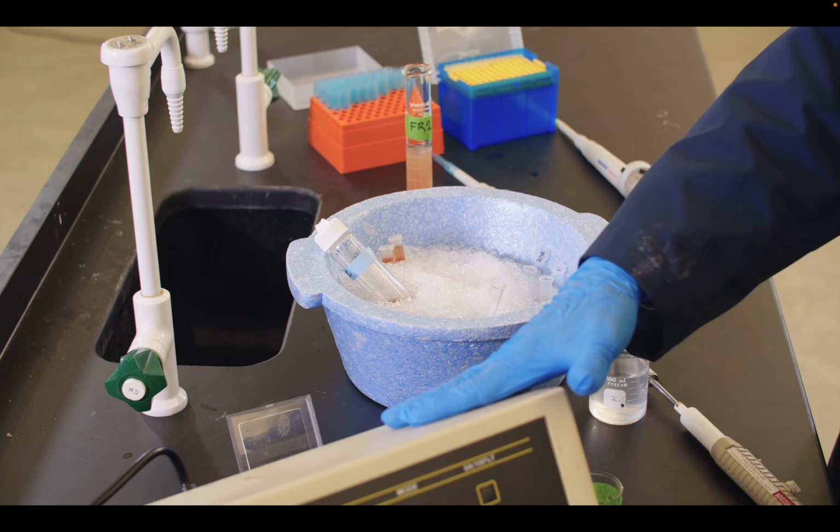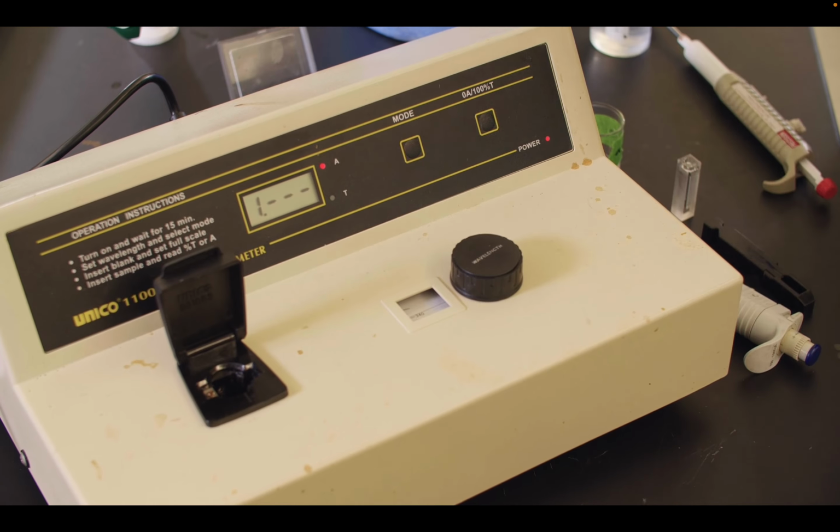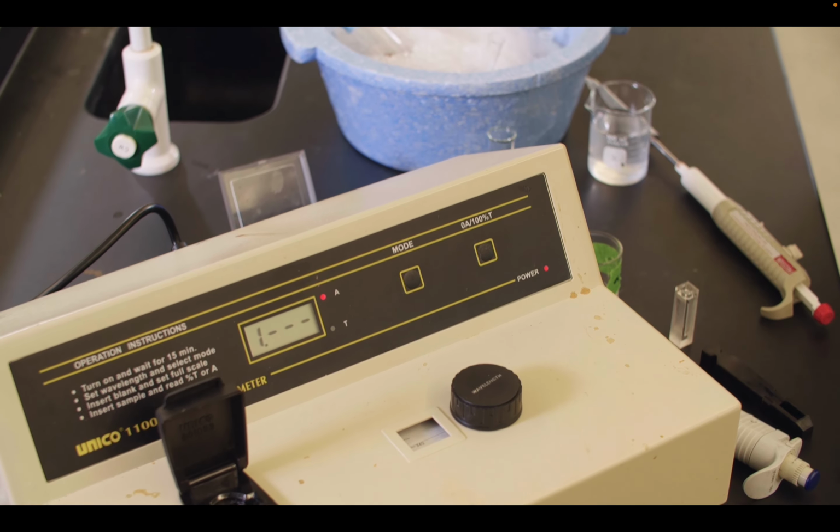Recall that the GOT activity is a coupled assay where one reaction's product reacts by malic dehydrogenase and NADH, and NADH is the source of what we're able to observe. We're going to observe NADH in our spectrophotometer, which is set to 340 nanometers, where NADH absorbs. As the NADH reacts, it will degrade, and we'll see that absorbance go down.